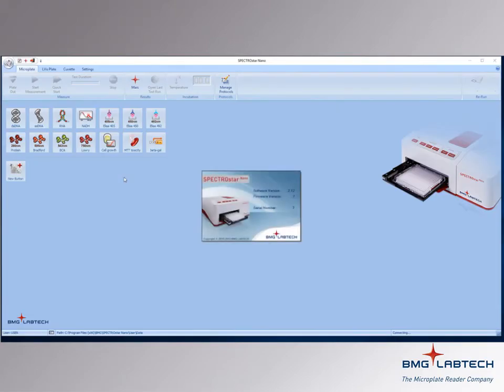If the Nano is powered on and connected to the computer, it will be detected. Software and firmware version, as well as instrument serial number, will be displayed.